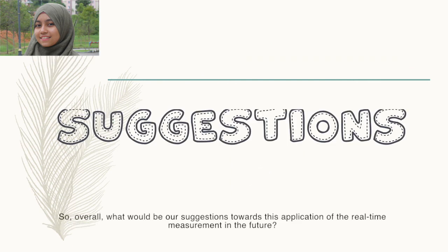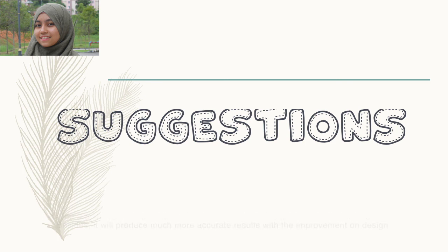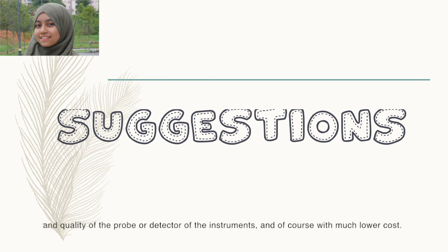So overall, what would be our suggestions toward this application of the real-time measurement in the future? Maybe 5 or 10 years in the future, this type of particle size measurement can be applied to various other fields other than the pharmaceutical field. Besides, it will produce much more accurate results with the improvement on design and quality of the probe or detector of the instruments, and of course with much lower cost.